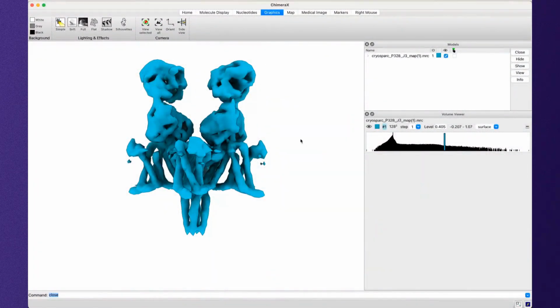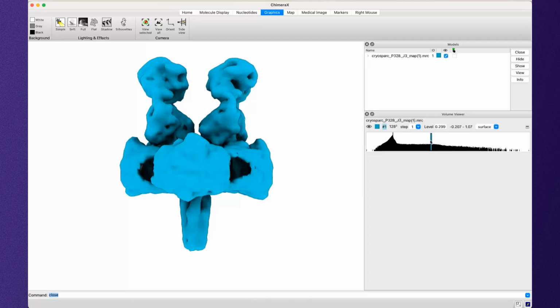When we make a mesh, we are going to be telling CryoSPARC whether or not it should split the mesh into sub-regions. And I know that sounds like a lot, but if we just plug in our map into the 3D Flex Generate, it will put everything that is inside of our mask in the same mesh. And the reason that this matters is that, remember, we don't let things that are inside a tetrahedron move apart, okay? Everything that is within a tetrahedron must stay continuously attached.